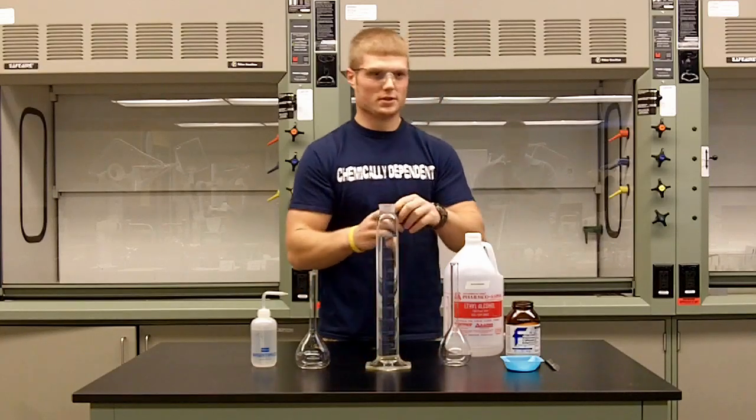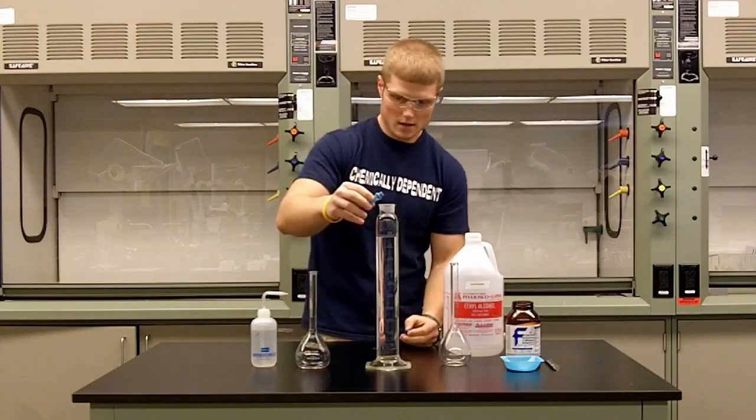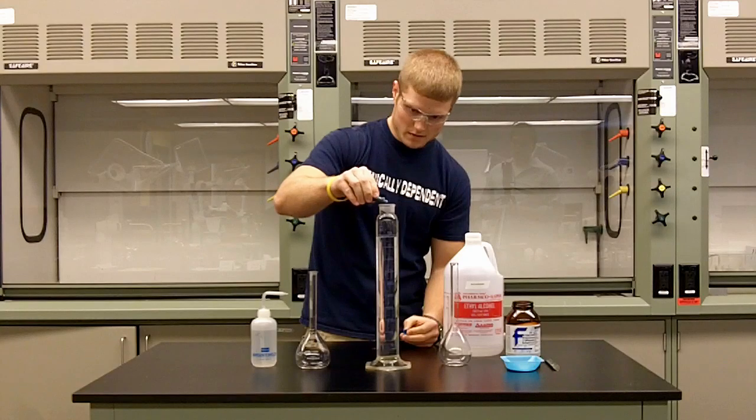So now what we're going to do is take a little bit of food coloring just so we can see the separation process occur when we add the salt. We'll add five drops of the food coloring.